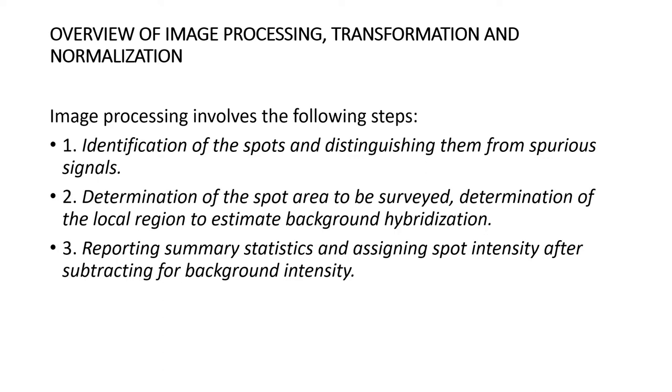On the last hour we have discussed what is microarray, what are the different types of microarray data, what are the different types of errors associated with microarrays, and how we select the microarray spots for further analysis. So in this class today we will study how image processing is done and what we need to take care of about the different issues. Image processing involves the following steps.